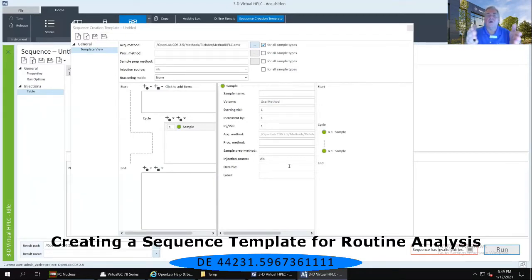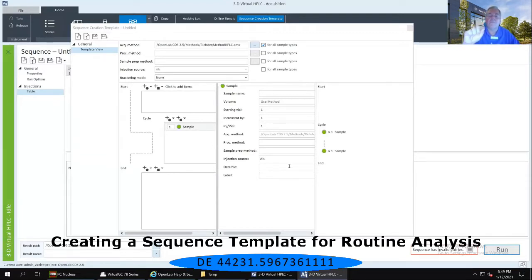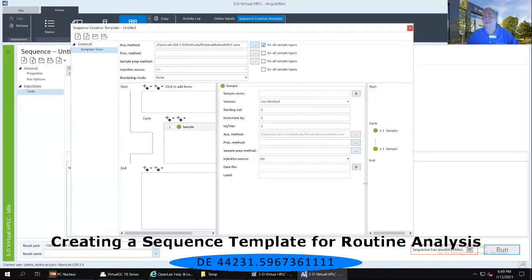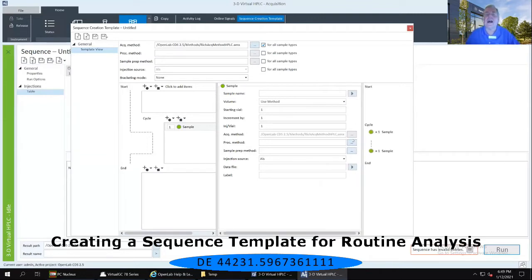There's the left-hand panel, the sample panel in the middle, and then the start panel on the right-hand side. In the middle panel where it says sample, there should be a right-facing arrow or three dots to the right of those fields — it's not visible because that window is too small. So I need to take my mouse, hover over that right panel that separates the sample from the start panel, click and drag it to the right until I see right-facing arrows and three dots.